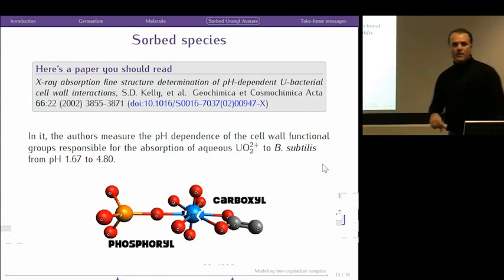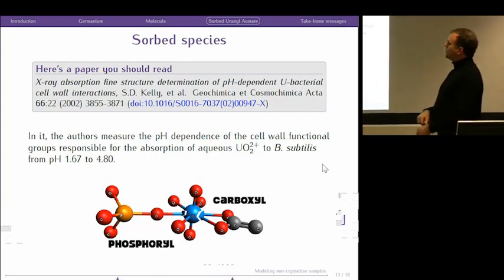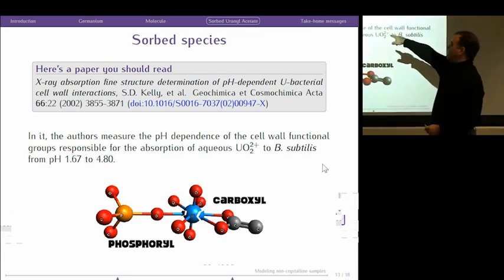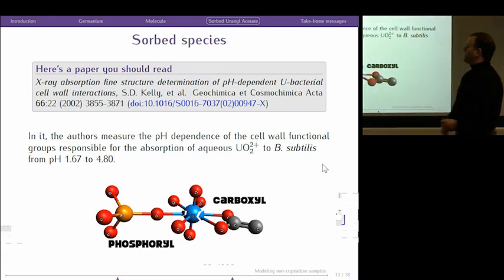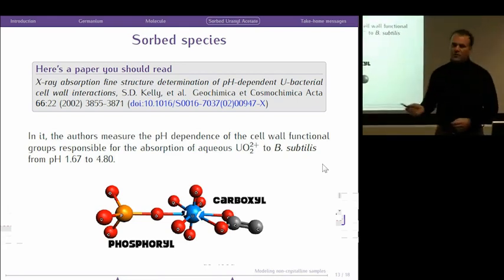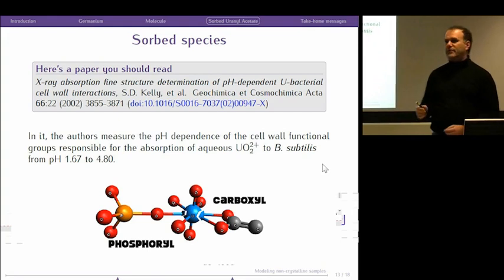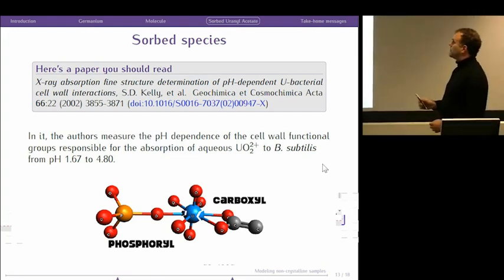And regardless of what you all do for a living, if you do XAFS, you should read this paper. This is a really clever paper. And Shelley is one of the real experts in this business of doing quantitative XAFS data analysis. She's a really clever person.